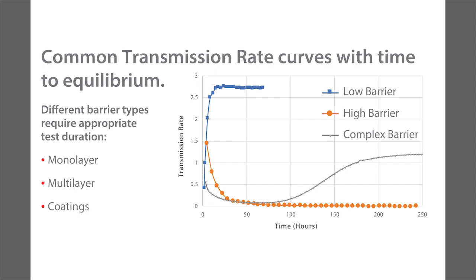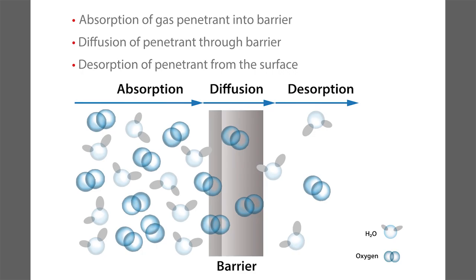You may wonder, why is it coming out? I think that's a good question. Why would I see this outgassing from the sample, and things come down to a low level like that graph was showing? If I go back to this initial schematic of the diagram of permeation, we've got a test gas here, we've got a barrier film, and we've got our other structure here. And this is where our nitrogen carrier gas would sweep.